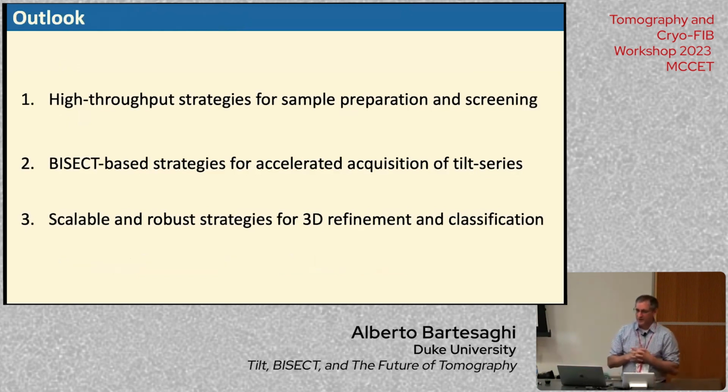So I want to end by saying that it's a very exciting time for cryo-electron tomography, because the way I see it, there are three things coming together. One is that we're getting better at actually producing these samples in a high throughput manner.